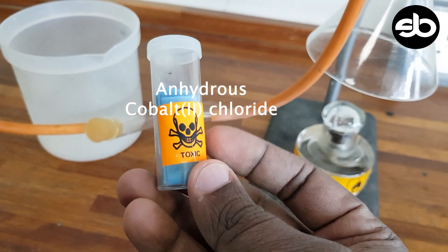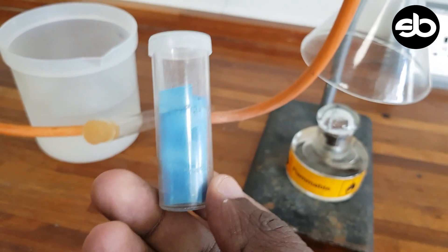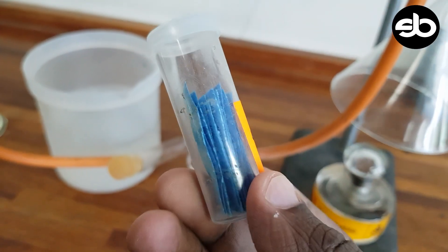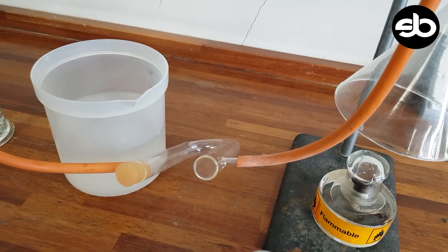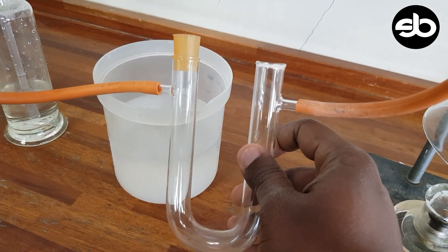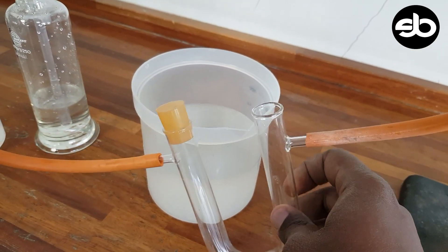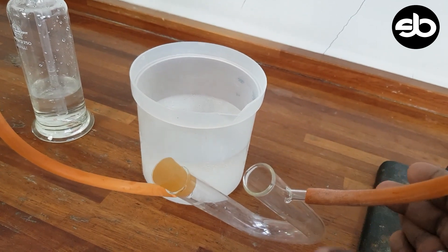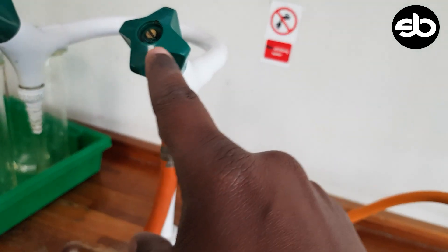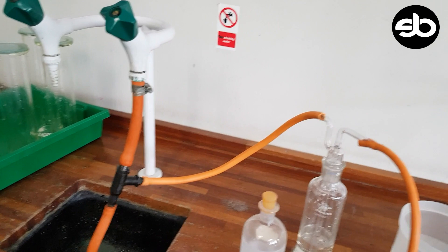Cobalt chloride paper is blue in color. We put the cobalt chloride in here and it will be immersed in cold water, and a suction will be generated from this tap as we go through the experiment.